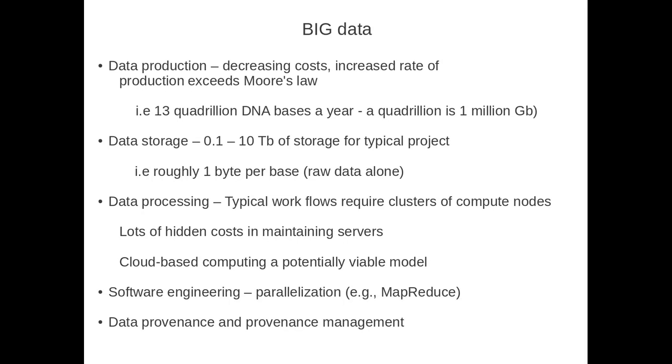So this is something that's important in data management. When we have a set of SNPs, we'd like to know where originally did the reads come from, what are all of the different tools that have been used to process those reads, and eventually, what SNP caller was used, what genotype likelihood model was used.